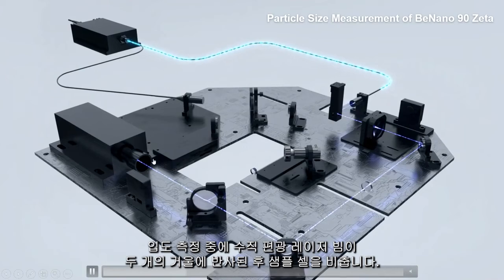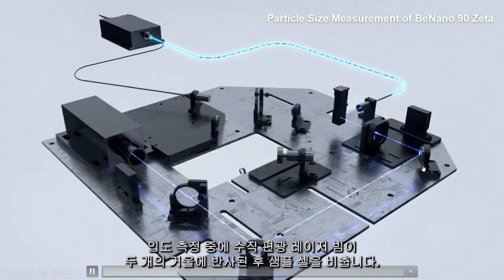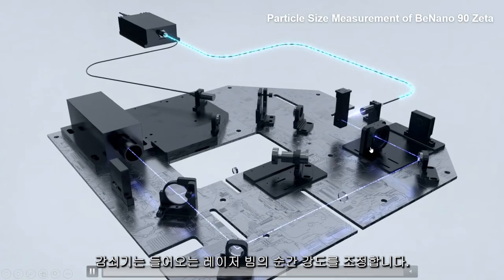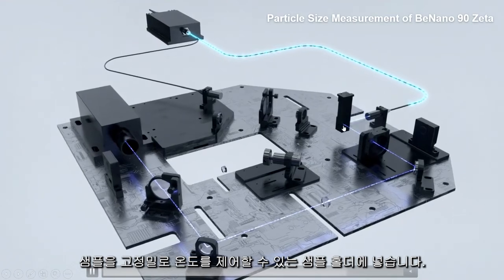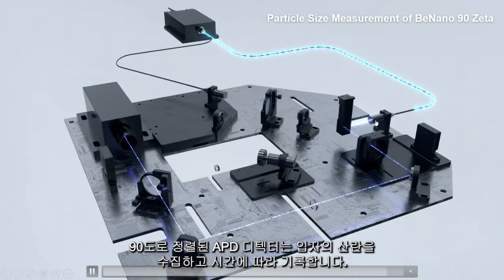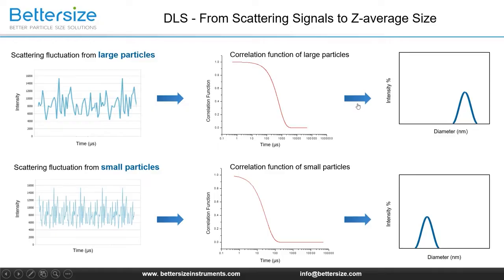During particle size measurement, a vertically polarized laser beam illuminates the sample cell after being reflected by two mirrors. The attenuator adjusts the intensity of the incoming laser beam. The sample is placed in the sample holder that is capable of controlling the temperature with high precision. An APD detector aligned at 90 degrees collects the scattering of the particles and records it with time.